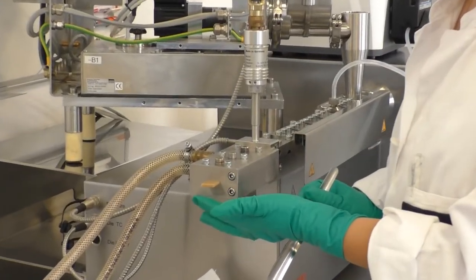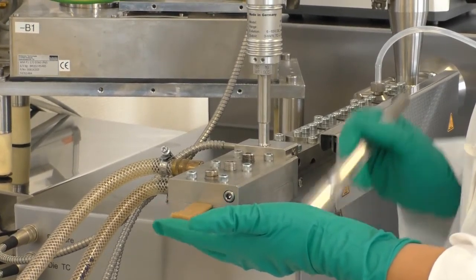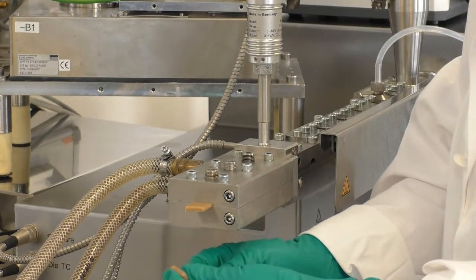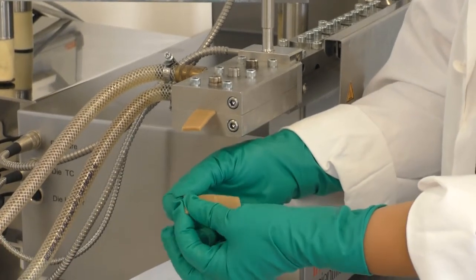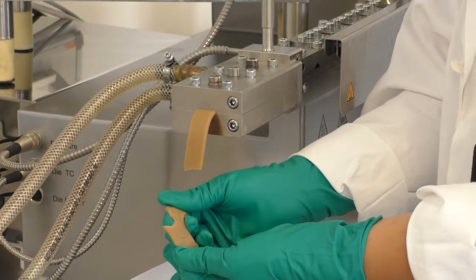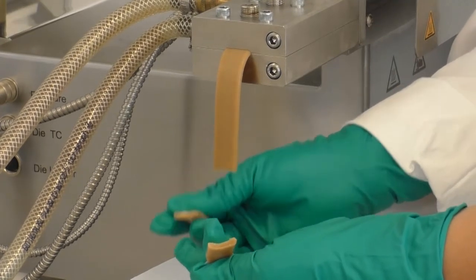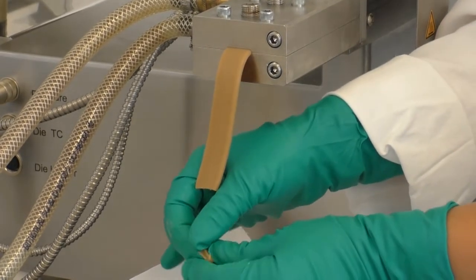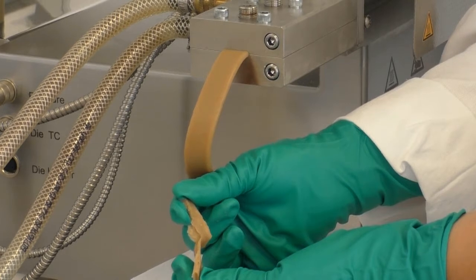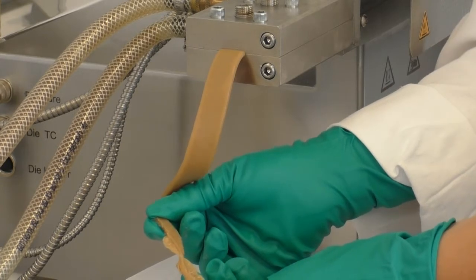from the die, I want to show you how fibrous and well textured it is. And this you can only see if you tear it apart. And you see that it does not tear in an isotropic way, but in an anisotropic way. And it also shows fibers, which you can see if you tear it along the flow direction very carefully. Then you see the fibrous structure of the meat analog product.